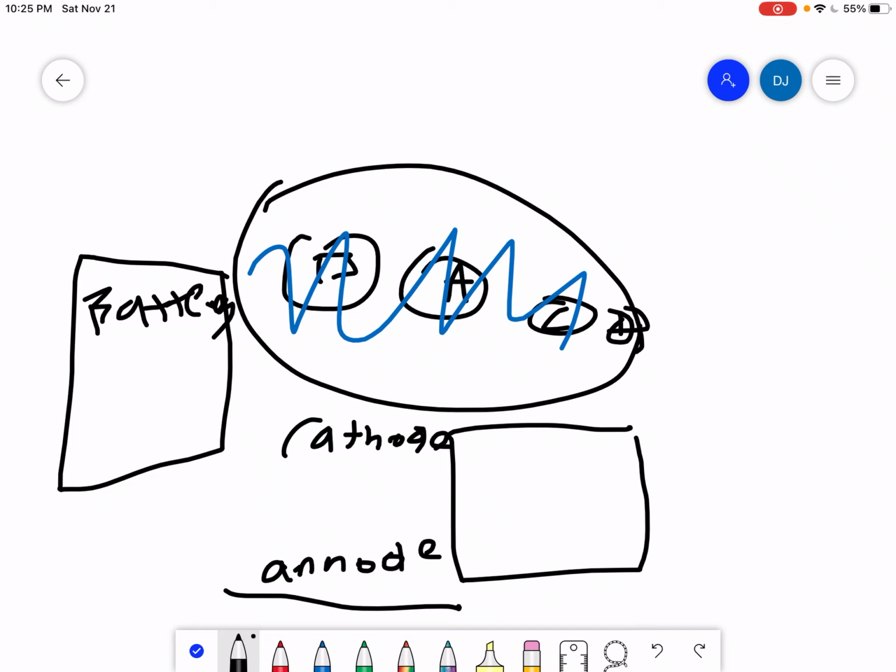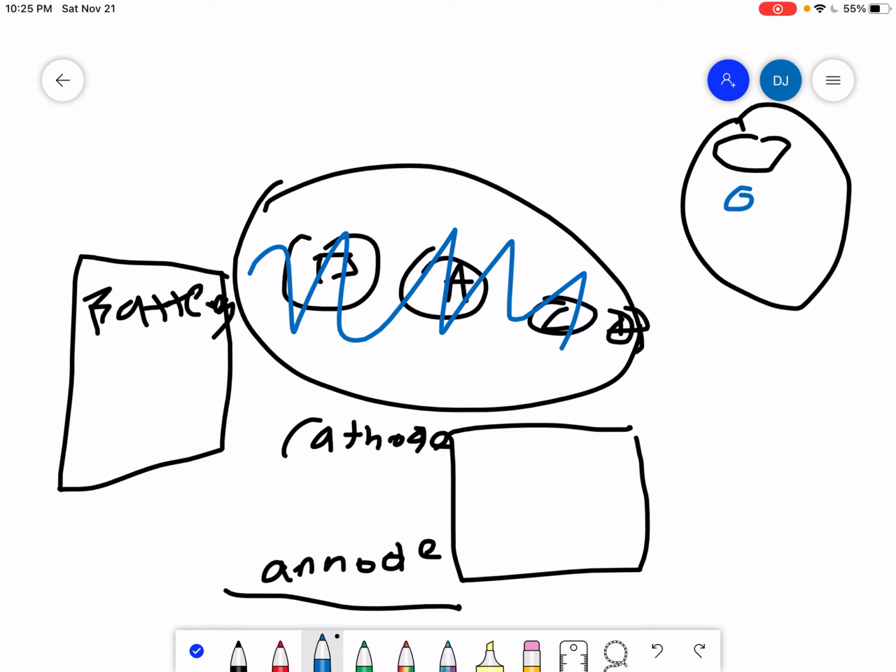But why is this so useful? Let's just think about it. We know that the gel is porous, which I should have specified before, which means that it has pores in it. Just think about it logically, right? If a gel has pores in it, meaning tiny holes for the fragments to pass through, then the larger fragments are probably going to pass through the pores with more difficulty than the smaller fragments.